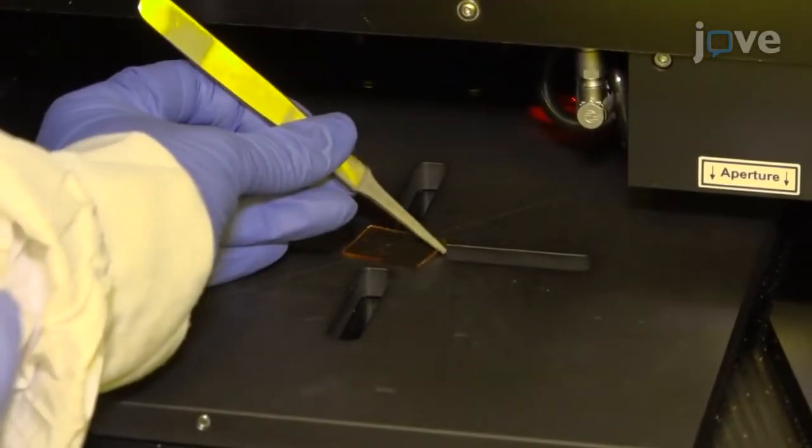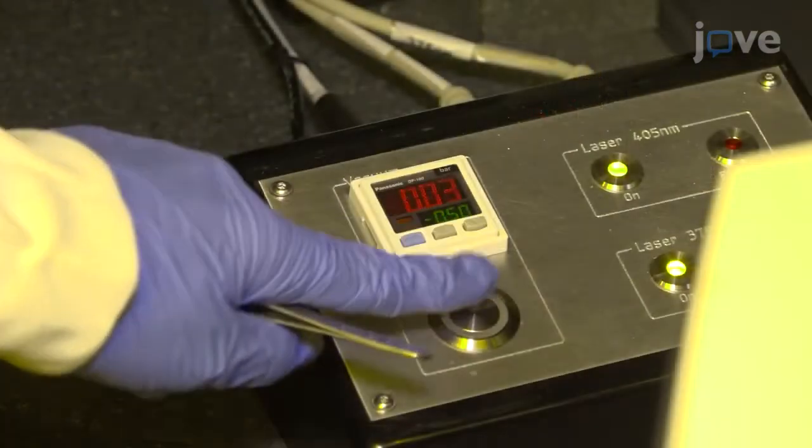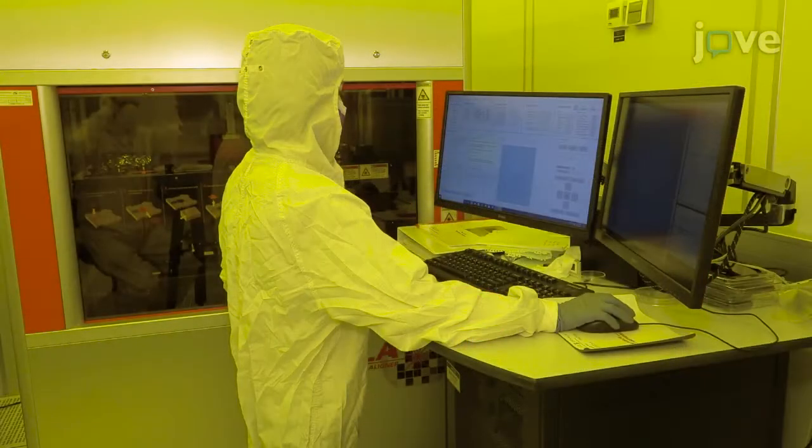Coat the glass with photoresist using spin coating at 6,000 rpm for 60 seconds to attain 1.5 micrometer thickness, and bake at 100 degrees Celsius for 60 seconds. Expose the sample to a light source using a photomask or maskless lithography to achieve the desired pattern.